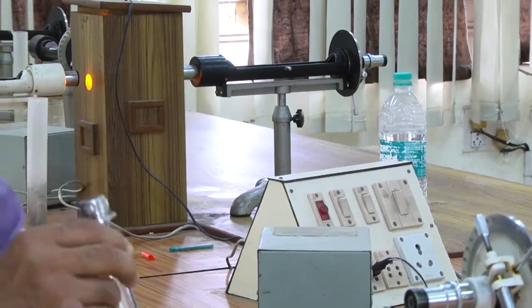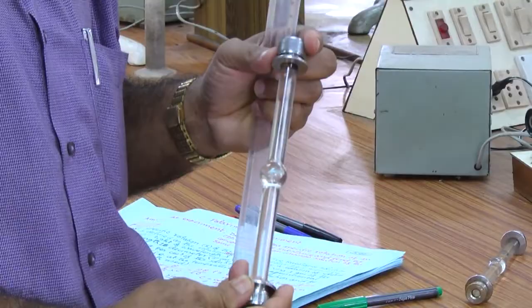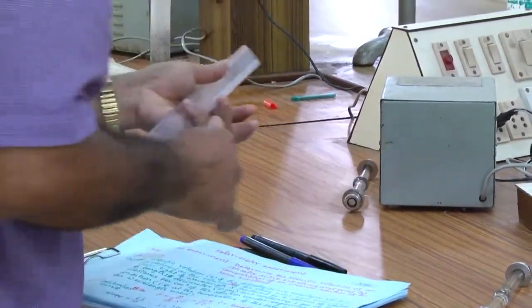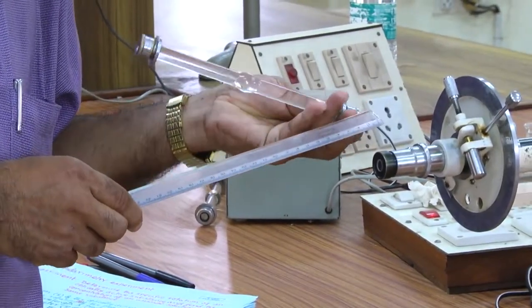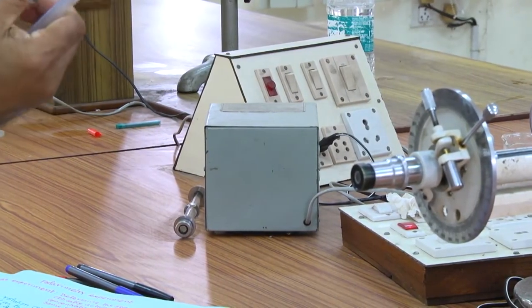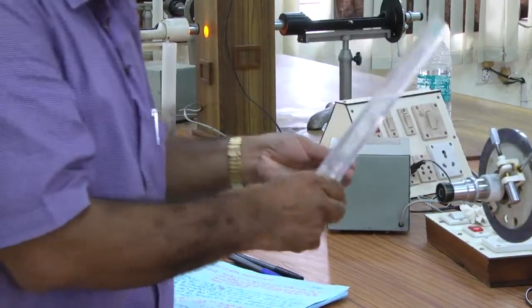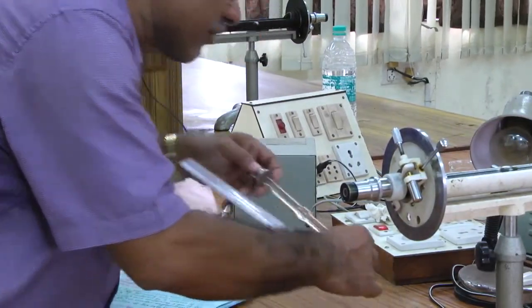Okay, another solution is there. Generally it's 20 centimeters, either you can measure or here it is given, generally 20 centimeter this length, or you measure and find out. It's difficult to measure this way.